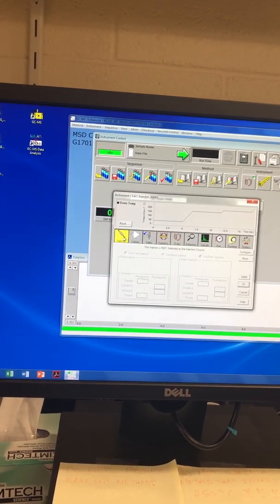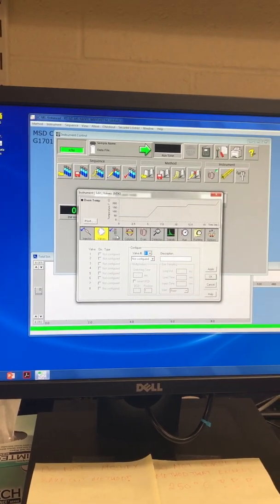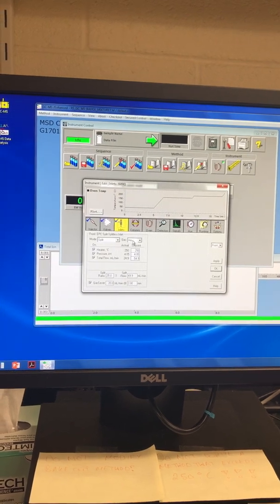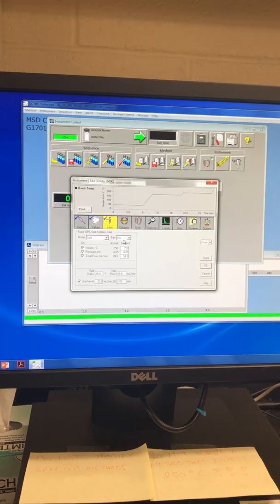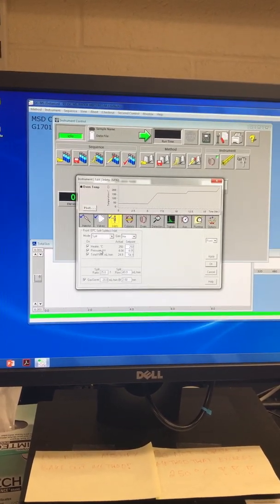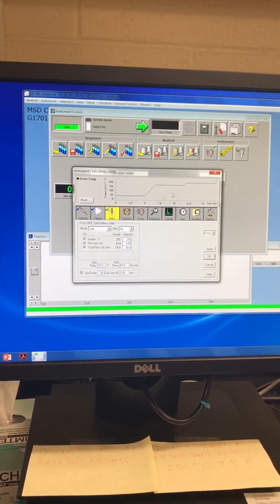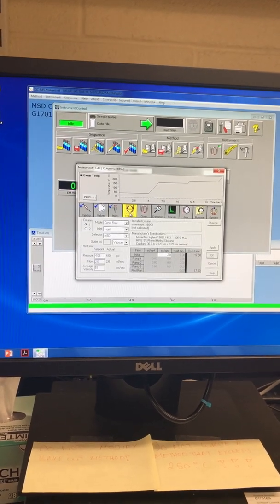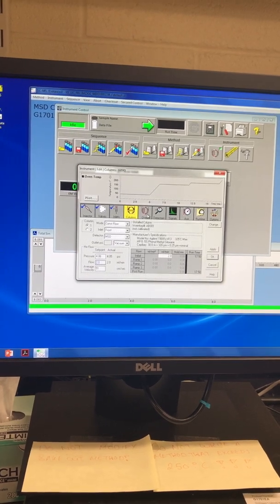So the injector and the valves stay the same, nothing changes. For the inlet, nothing changes as well, but you can just go ahead and check if your gas is helium and check if the gas in the tank matches that. And the mode should be on split, and just make sure that these values are actually here, but you don't need to change anything. Then you can go ahead and click column. For the column, everything stays the same, so you can go ahead and click open.